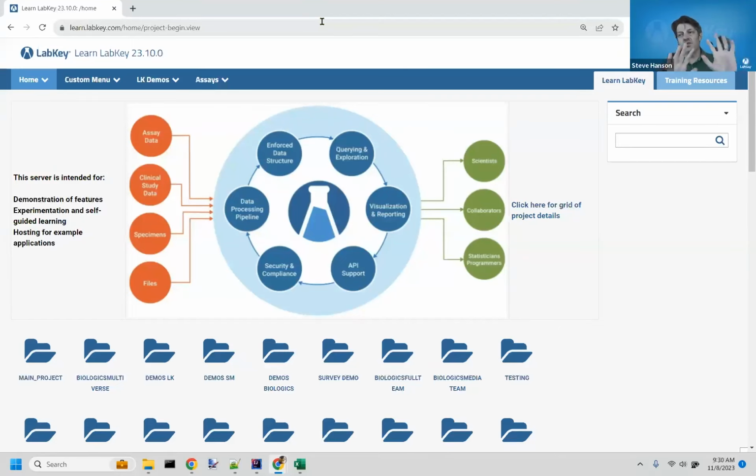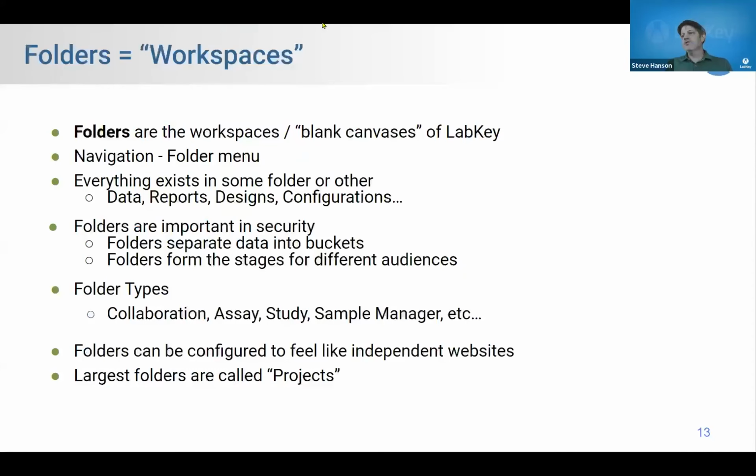Anyways, I just sort of touched on a huge theme. We're going to keep coming back to that theme. It's one of the things administrators need to know over and over again. That pattern keeps reemerging. Okay, so folders, super fundamental. Everything is about folders.